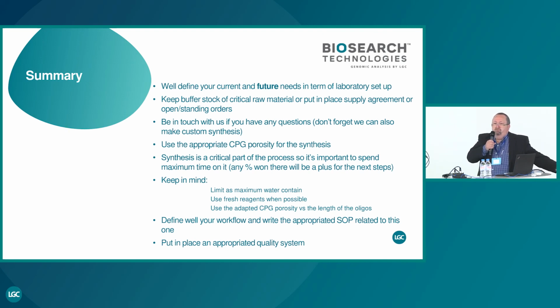We spoke about ammonium hydroxide. It's a very cheap reagent. Sometimes it's better to use it and maybe to use a new bottle. For the ancillary reagent, it's better to open the bottle, put it on the instrument, and not buy a big bottle and transfer into a small one. When you do that, moisture will come inside. It's not good to do it.